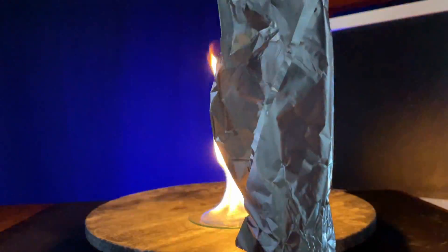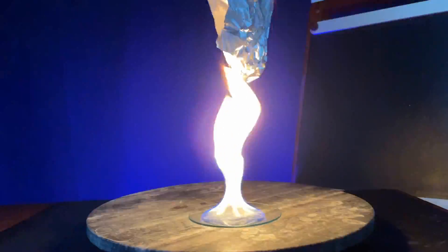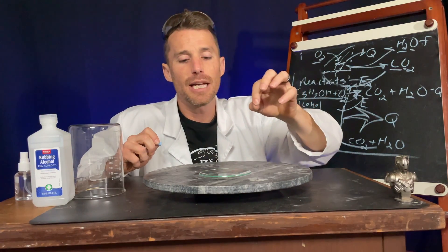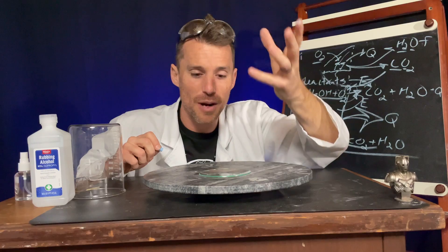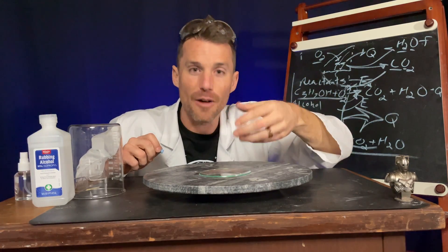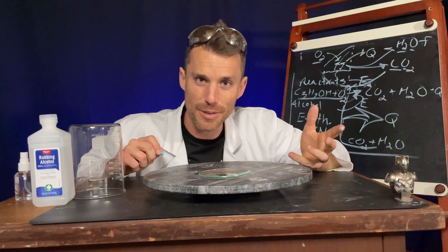The last thing I did where the aluminum spun over the flame — that's called the convection current. The hot air is rising, and that ends up being pretty important. Because if the hot air wasn't rising and taking away the CO2 and H2O, those things would want to go down and put out what's burning. They'd stop our reaction, like we see in the beaker.